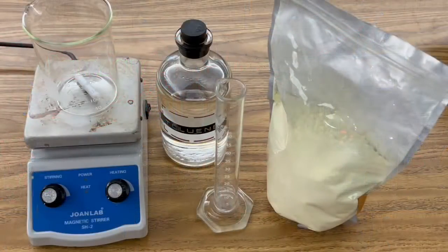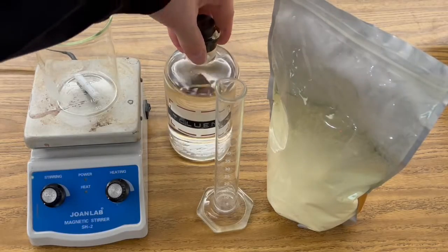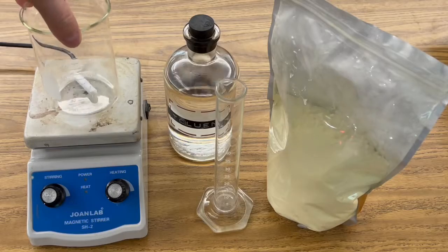Today I want to share with you the beautiful recrystallization of elemental sulfur. Check this out. All I'm using in this investigation is powdered sulfur, a 50 milliliter graduated cylinder, toluene, my magnetic stir plate, and a 300 milliliter beaker.